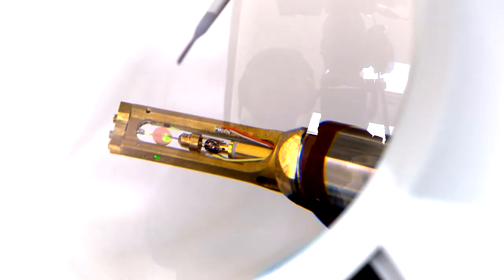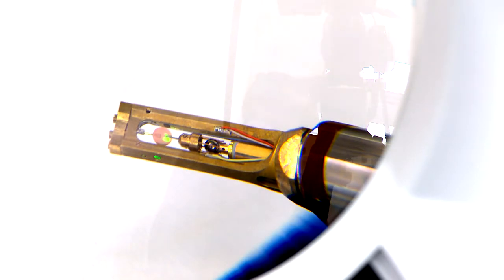The only device on here that would be present in a conventional sample holder is the TEM grid itself. Neither the mirrors for the optical coupling, nor the STM tip, nor even the electrical connections running down to the sample would likely be present.